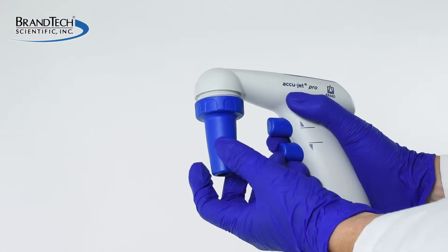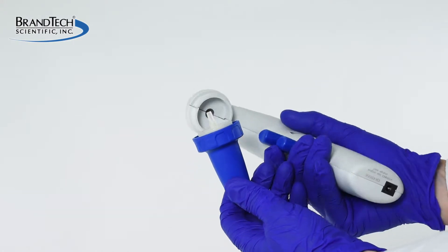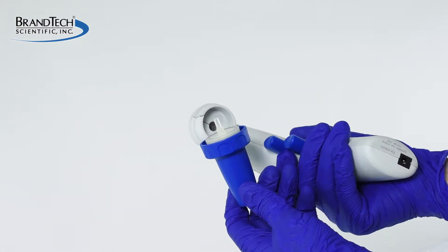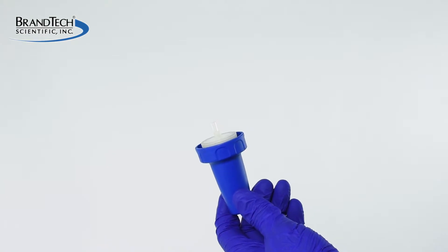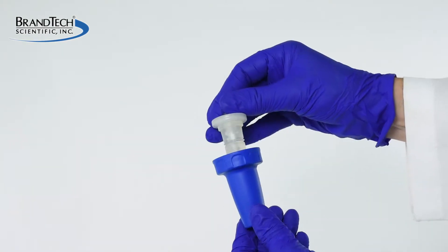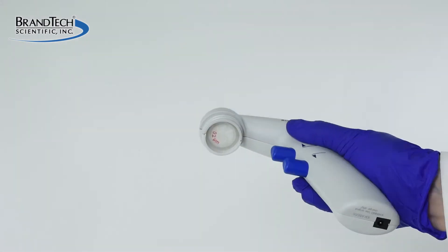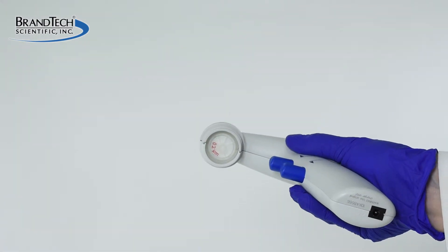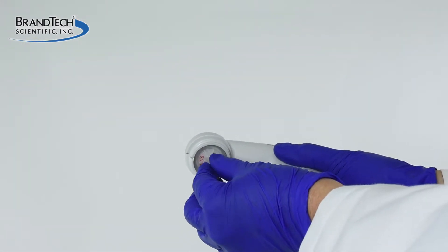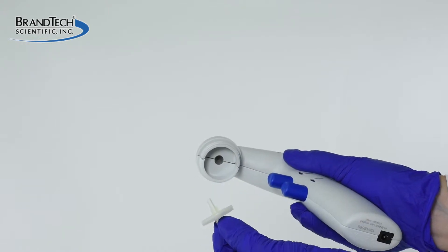Remove the filter from the AccuJet by grasping the adapter's support and unscrewing it from the body of the AccuJet. The filter will most likely protrude from the silicone pipette adapter, but might possibly be lodged inside the body of the AccuJet. Grasp the fitting and remove the filter from the AccuJet.